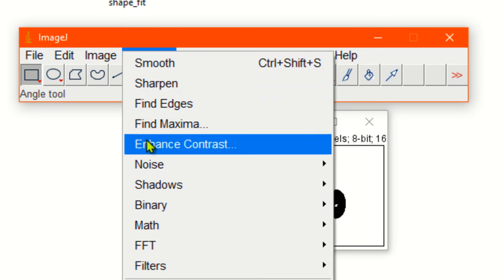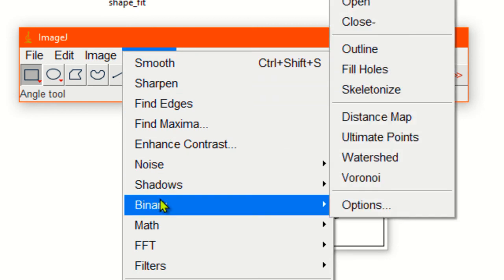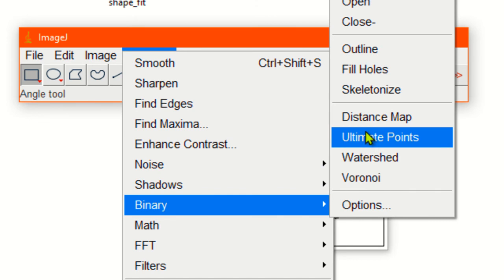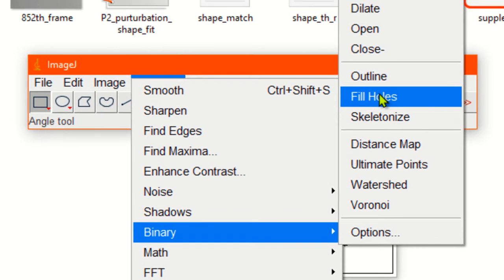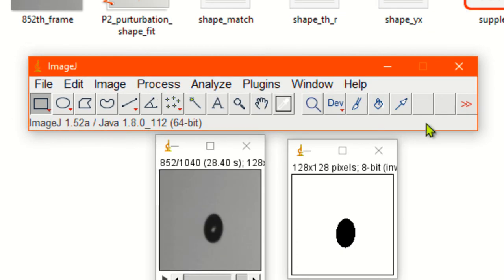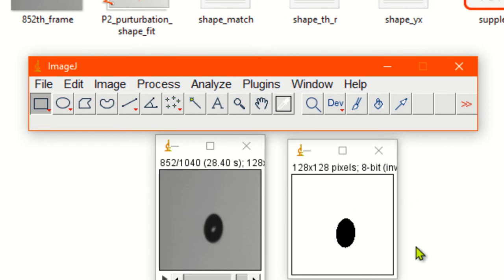Go to process from the drop-down menu. Go to binary. In the binary you will find fill holes. Now you can see the hole is filled.